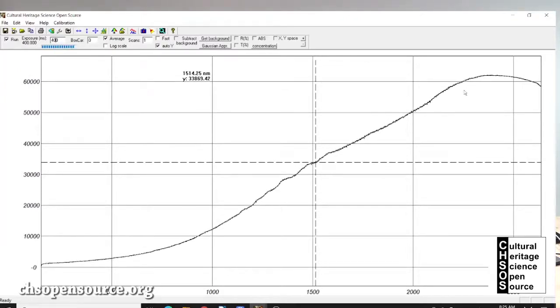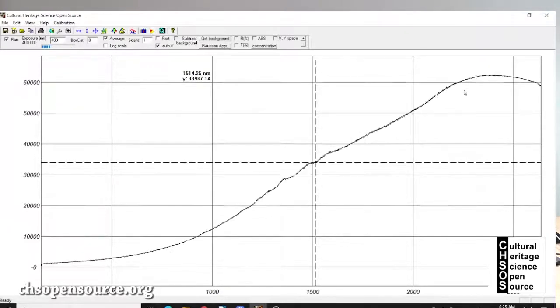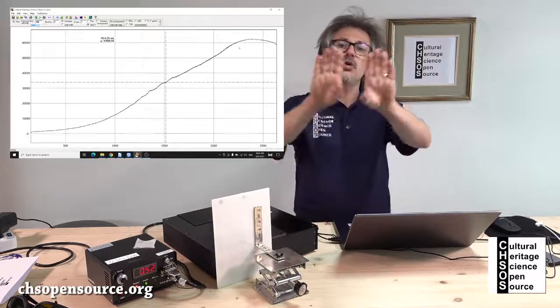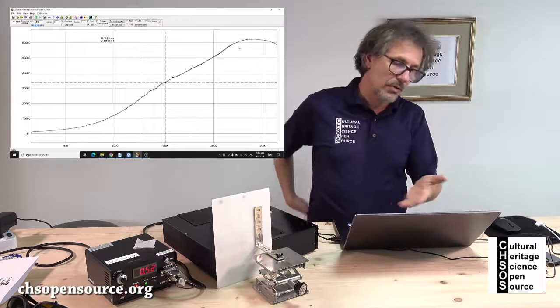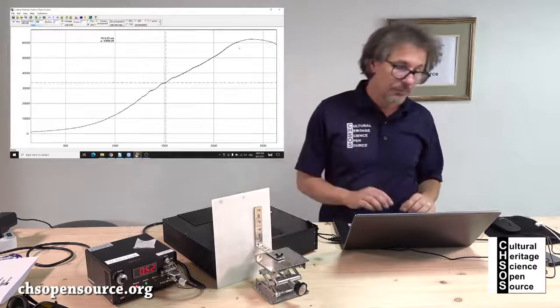Okay, so basically right now this is the best we can do with our system to collect the spectrum of naphthol red. So the slit now is all open. So I turn basically the knob clockwise, and it's all open, the maximum. So we get a lot of signal, so our spectrum, in just 400 milliseconds, so 0.4 seconds.